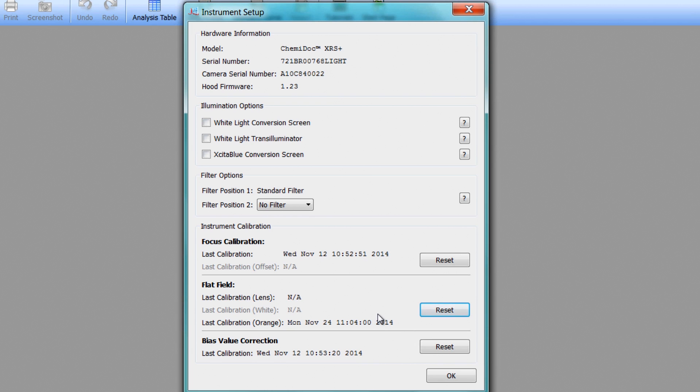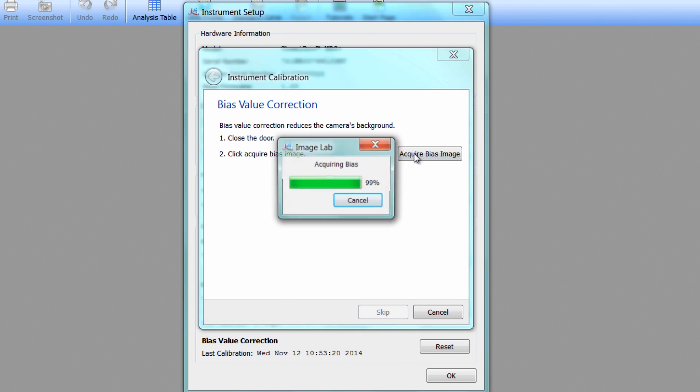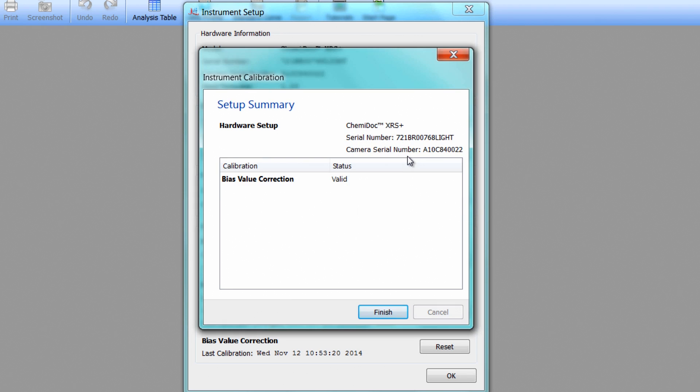Now, go to Bias Value Correction in the Instrument Setup window and click Reset. Make sure the imager door is closed and click Acquire Bias Image when ready. This correction is necessary to reduce the camera background signal. Once completed, click Finish.